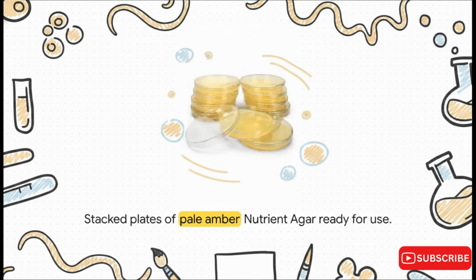And here is what nutrient agar looks like in reality. Notice that pale amber, almost beige, gelatinous look. It's completely transparent, calm, and basically just waiting for life to be introduced to it. It really is the blank canvas for a microbiologist.